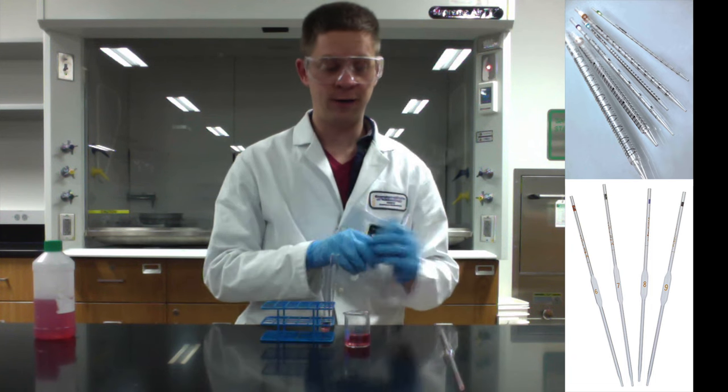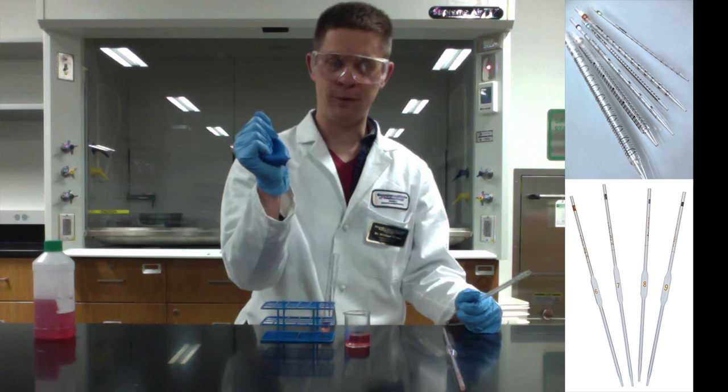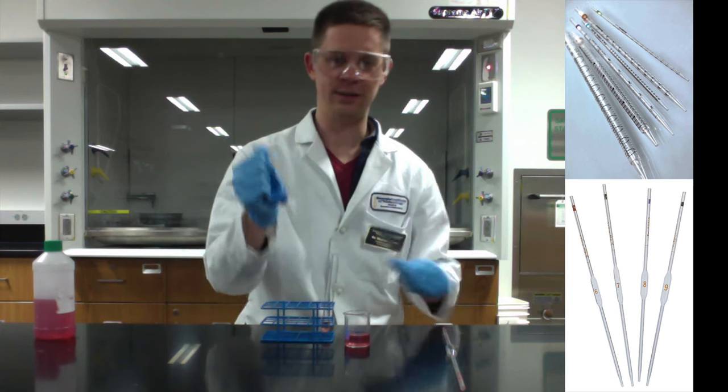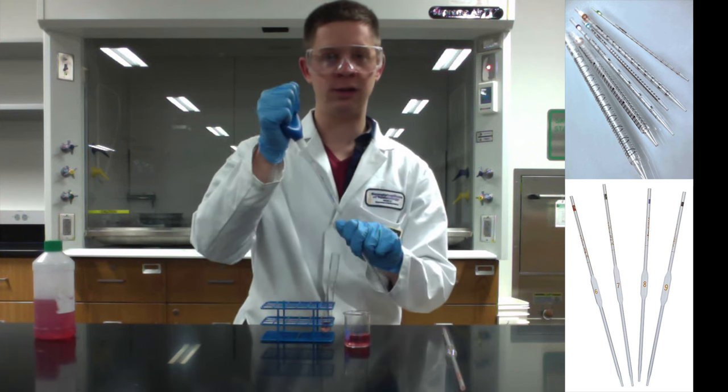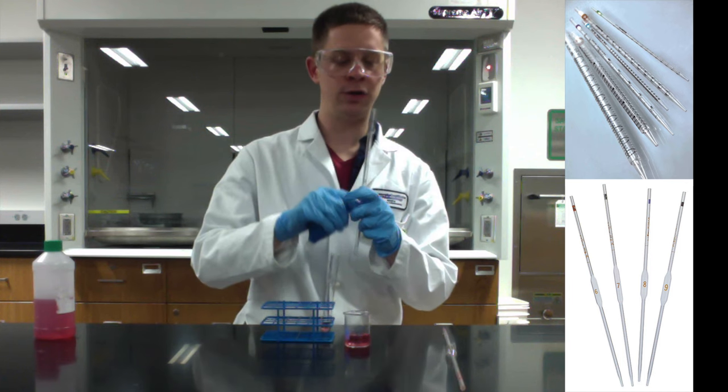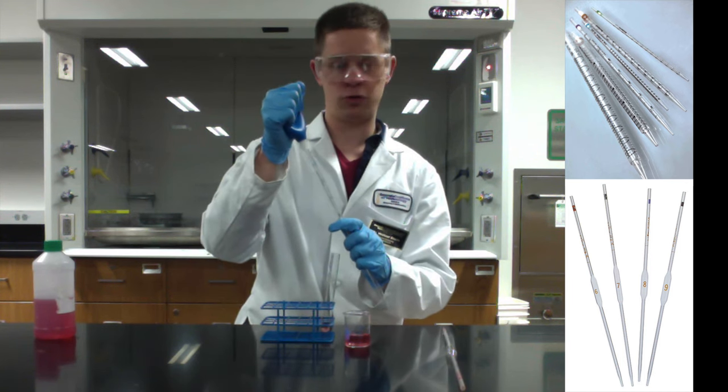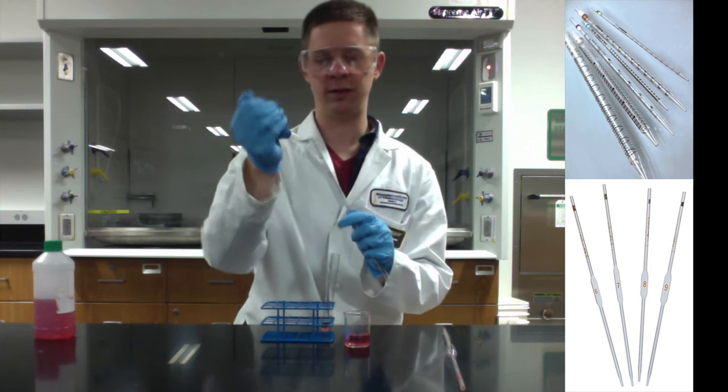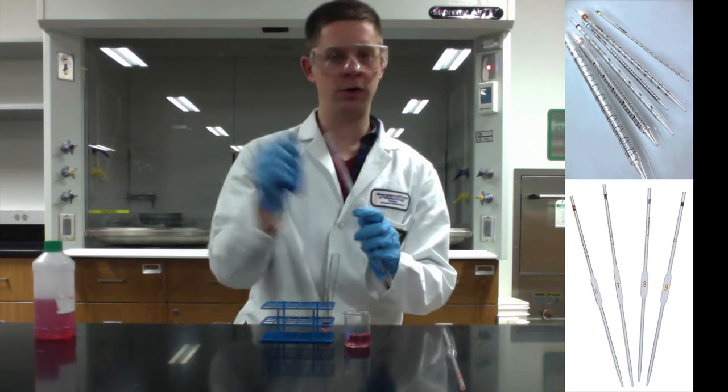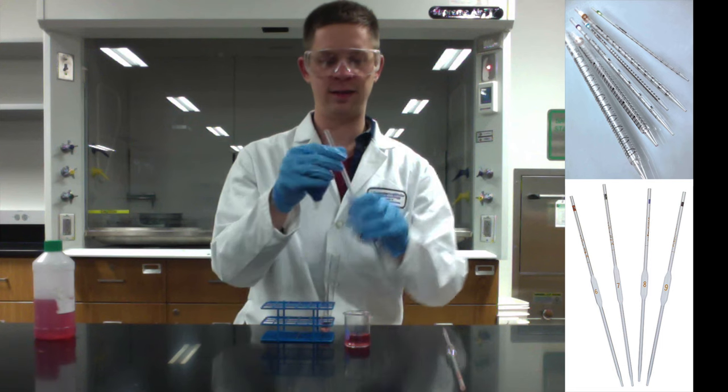When transferring, squeeze the pipette bulb first, place the plastic part onto the end of the pipette. Gently let up, and do not be afraid to go above the liquid level. Be gentle with the pipette bulb. Don't just kind of let it all come up at once, because then you'll pull liquid into the pipette bulb. But you're welcome to go above the line, and that's the easiest thing to do.